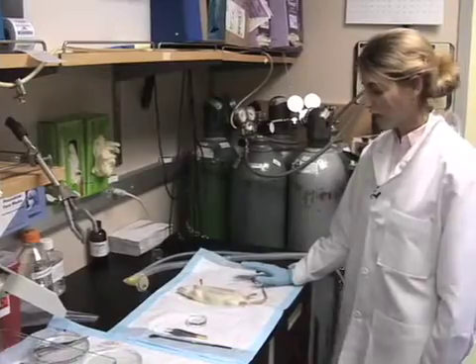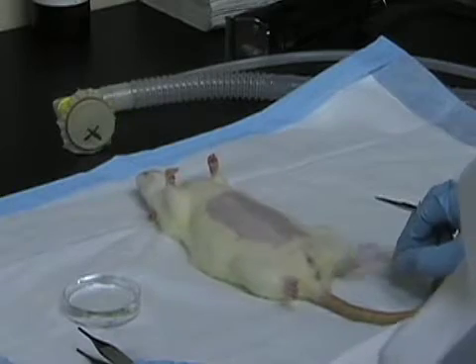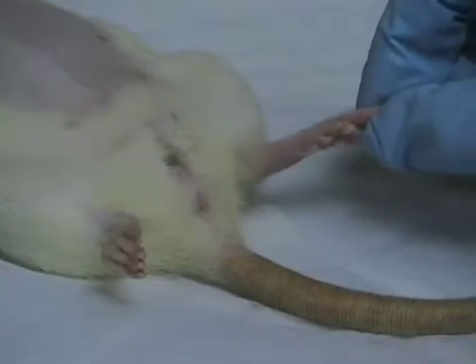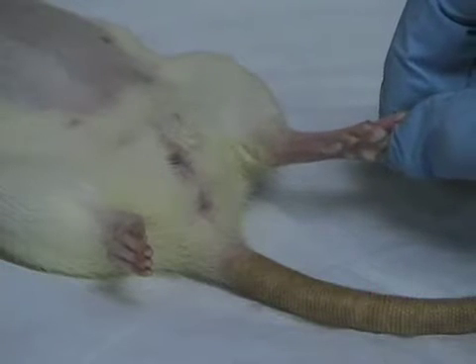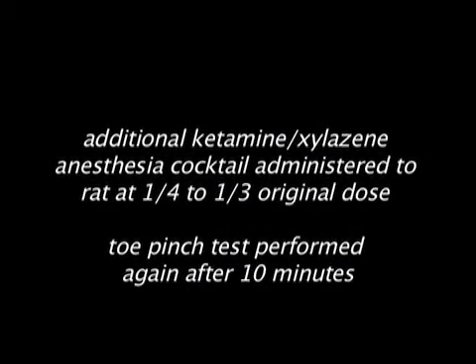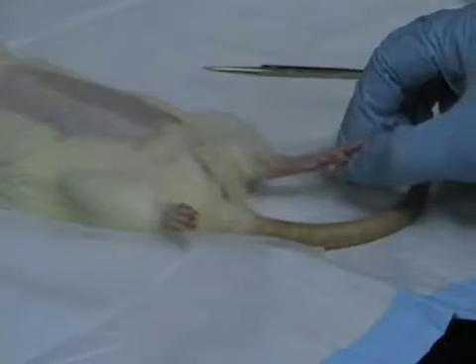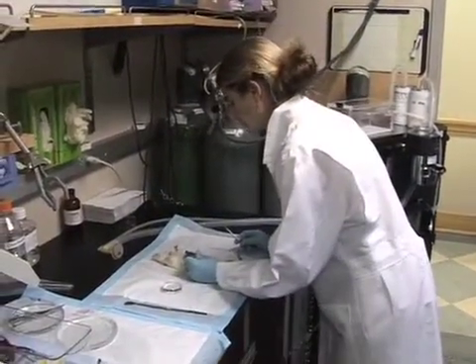Now we're going to make slice cultures from the brains of embryonic day 18 rat embryos. First I'm going to check that the mother is fully anesthetized by toe pinch. Here's an example where the rat still has a tiny reflex and is pulling its hind leg back a little bit when I squeeze on its foot, so we'll have to wait longer or re-anesthetize a bit.